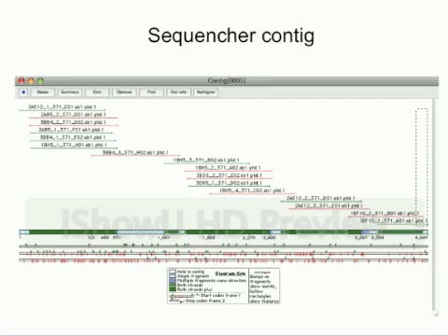on the sequence line are start codons, but these red lines are all stop codons. So for the first frame, it's free of stop codons until the end. That's why I know that it's the correct frame. And then once you get the correct frame, you can look at where the SNPs are.